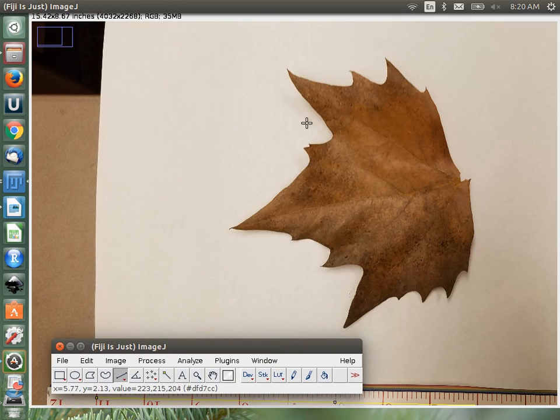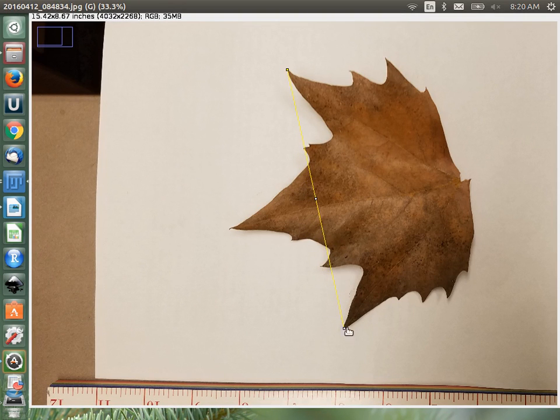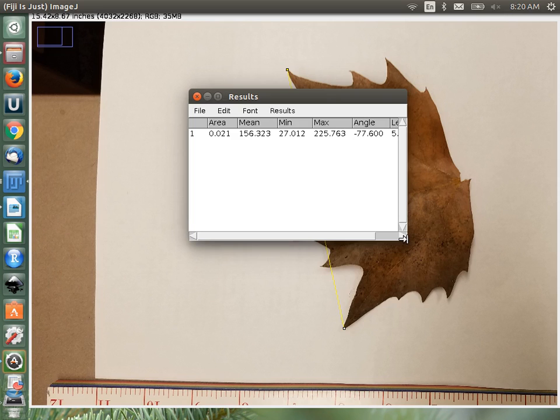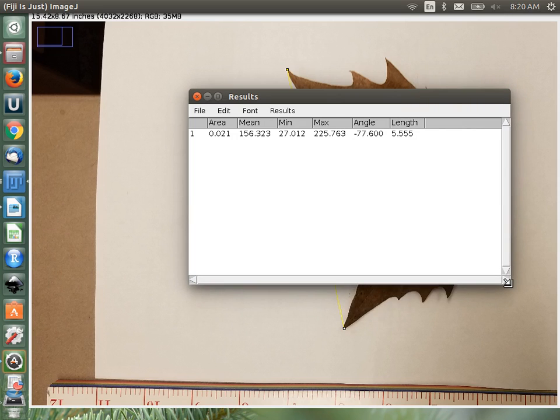Now we can get actual measurements. For example, if I want to know the distance between two points, I make a line between them and hit Control-M. Control-M takes a measurement. The length of this line is 5.555 inches. It also gives the minimum and maximum intensity values traversed by the line, the angle the line is at, and the mean intensity — all referring to the colors the line traverses.